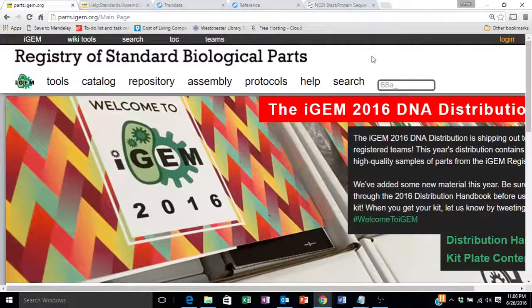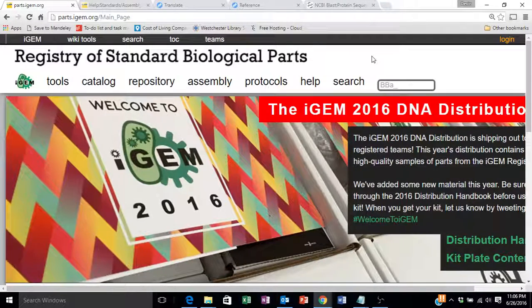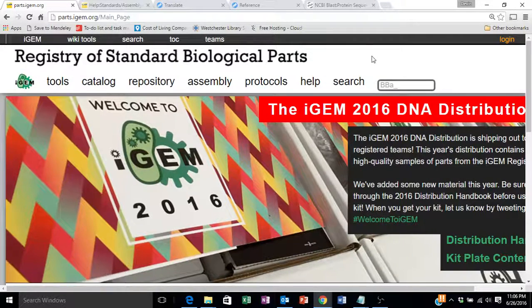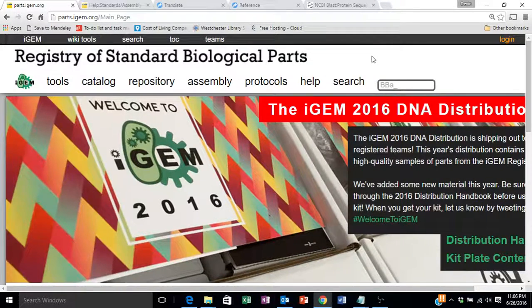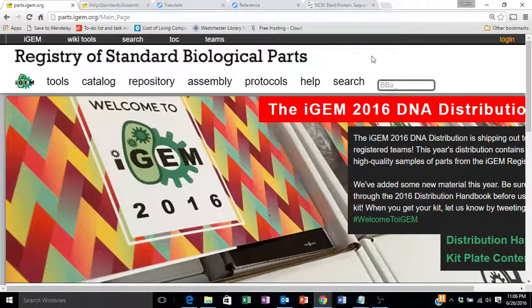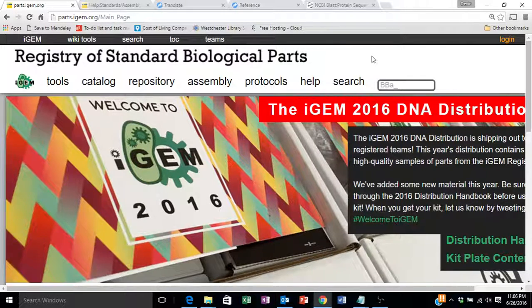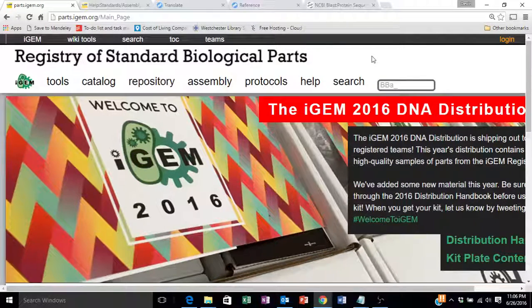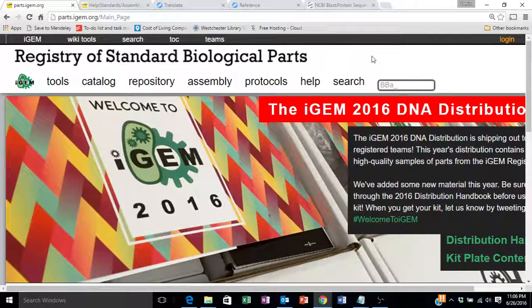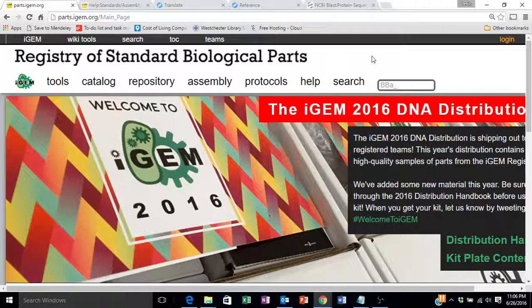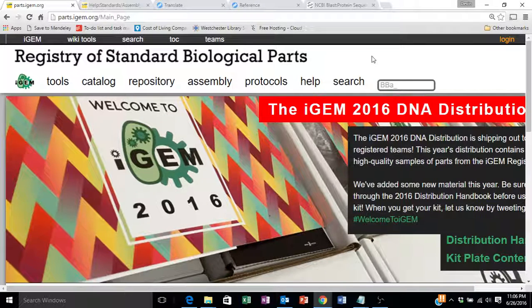Hello and welcome to this video tutorial on how to navigate some of the features found at the Registry of Standard Biological Parts, a key resource for iGEM teams.